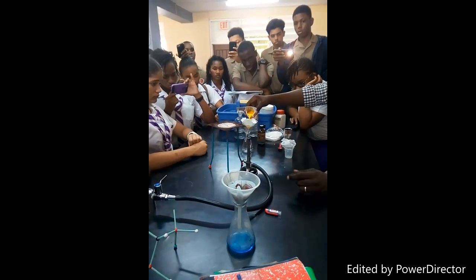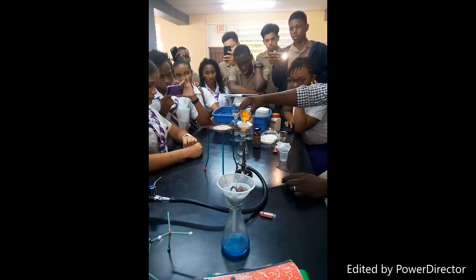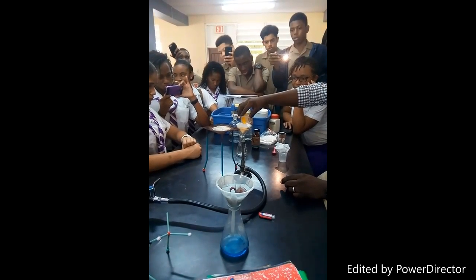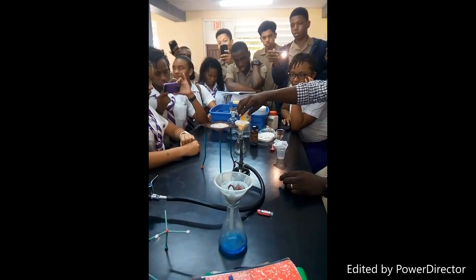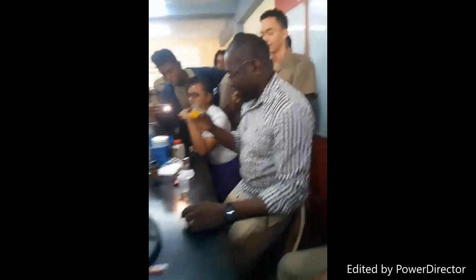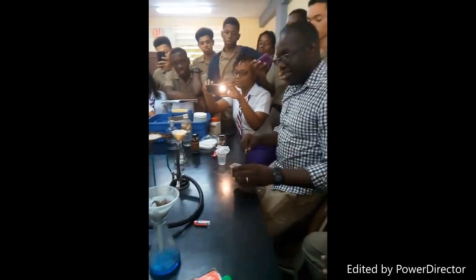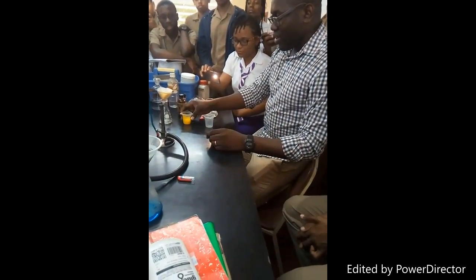Remember I said this is the hardest thing for you guys to do. I don't know why. Remember that lead is poisonous. Just saying. Many children have died. Children. Not when it was in pencil. You might not think you're a child, but you're a child.